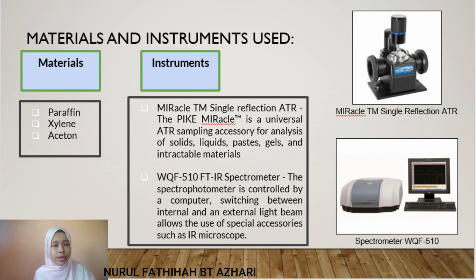Materials and instruments used in this journal are paraffin, xylene, and acetone. The instruments used in the journal are first, the MIRacle Single Reflection ATR. The PIKE MIRacle is a universal ATR sampling accessory for analysis of solids, liquids, pastes, gels, and intractable materials. Second, the WQF-510 IR spectrometer.